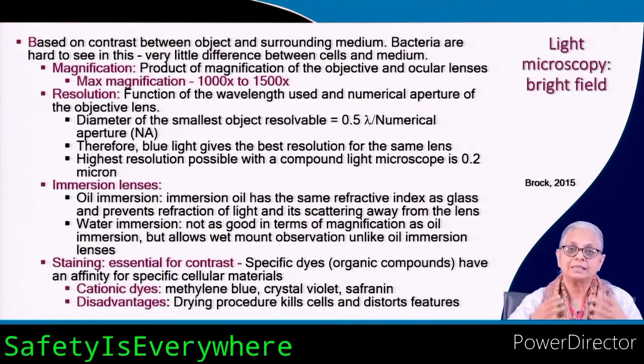You can literally see it teeming with living organisms at the microbial level, and so it's a very easy way to look at life without killing it. So water immersion is a very good way to be introduced to wet microscopy, if you want to call it that.